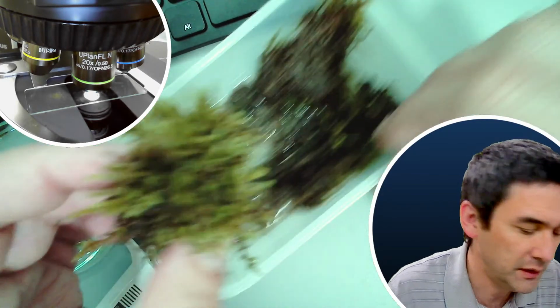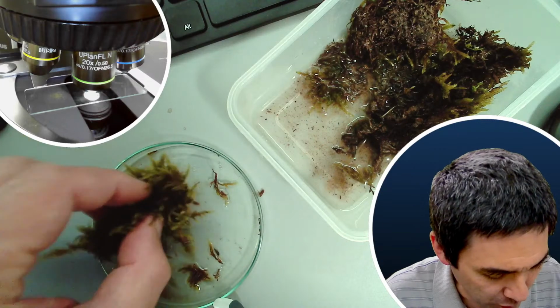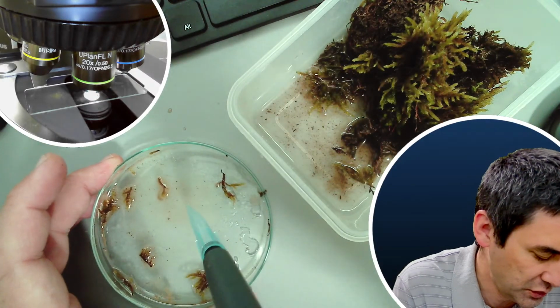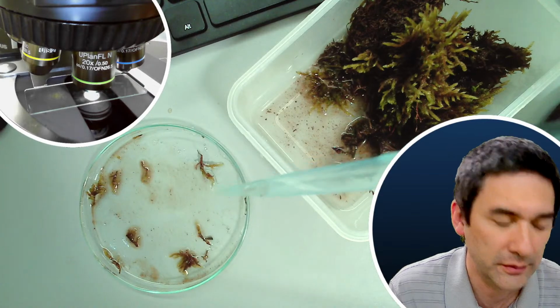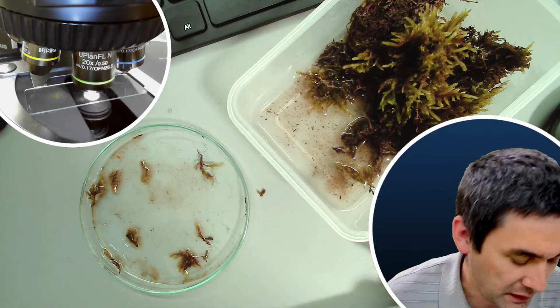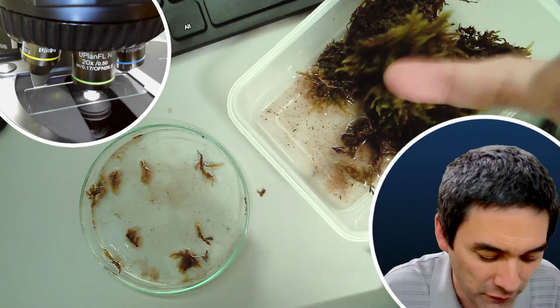I simply dipped it here and tried to squeeze out a little bit of the water. Then I've taken a pipette and tried to take up some of this and put it under the microscope. If you're lucky, you're going to find some tardigrades this way. Again, only those that are able to come off, because most of them, as I told you already, like to cling to surfaces.